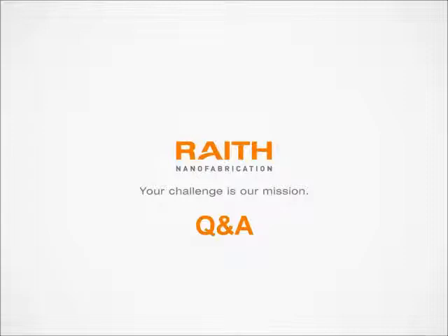Yeah. Another question. So we talked about drift. How do you maintain focus during these long operations? Okay, yes. So the larger area that you scan over, the more the sample can get out of focus.